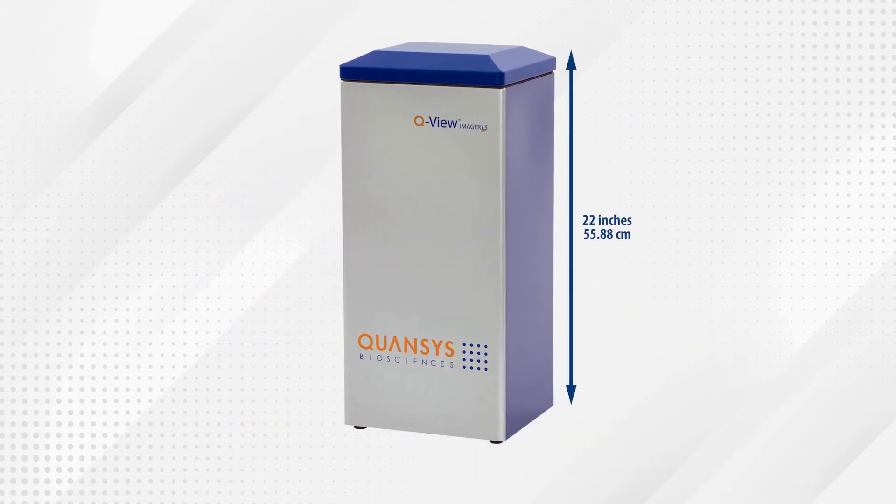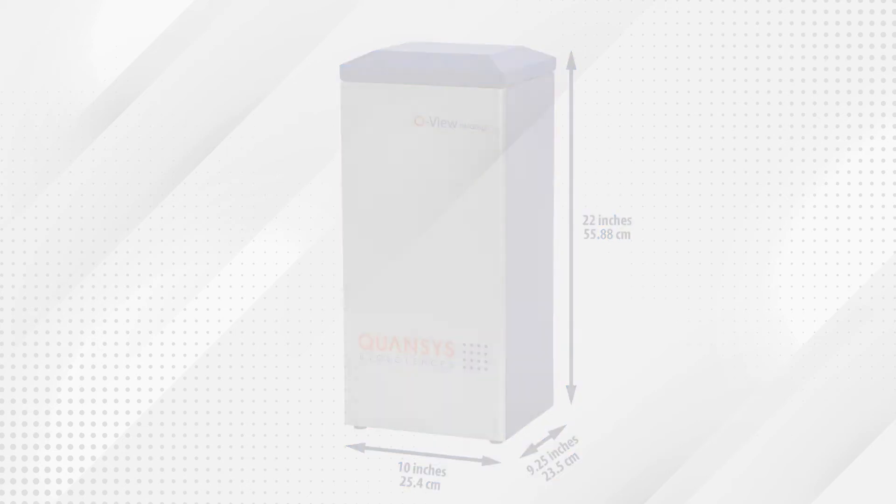Standing at only 22 inches high with a base smaller than a standard sheet of paper, the QView Imager LS requires minimal lab space.